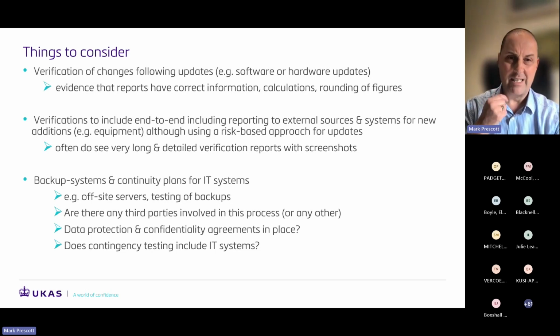And similarly, especially for any new LIMS systems, we need to make sure that the verification includes full end-to-end testing. This is all the way from requesting to reporting. So test requesting, for example, from a GP surgery or whatever system they're using, going into the laboratory LIMS, getting booked in, making its way to the analyzer, and then all the way back again to where it started. We do need to see that full end-to-end testing to make sure there's no issues occurring along the line.